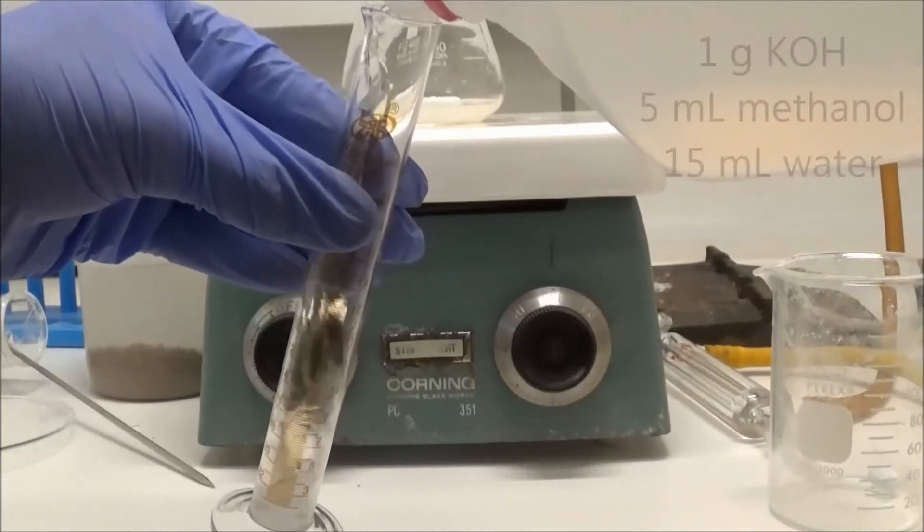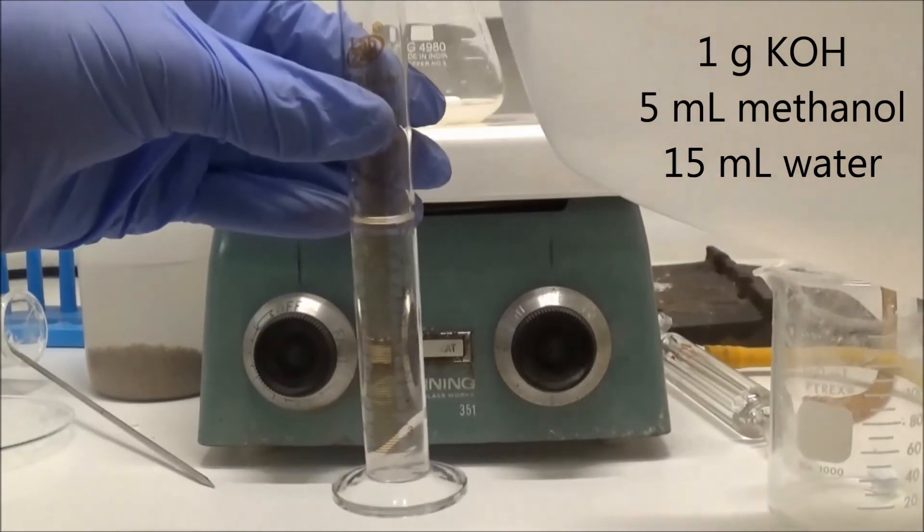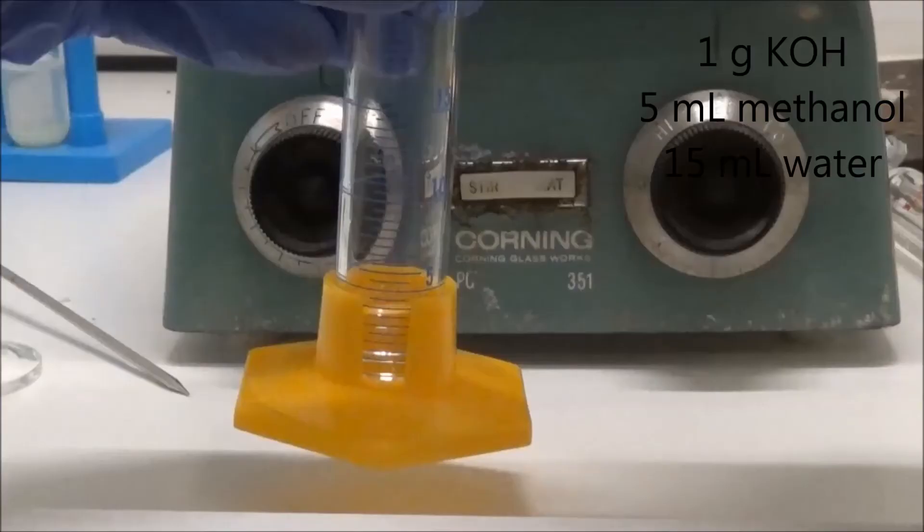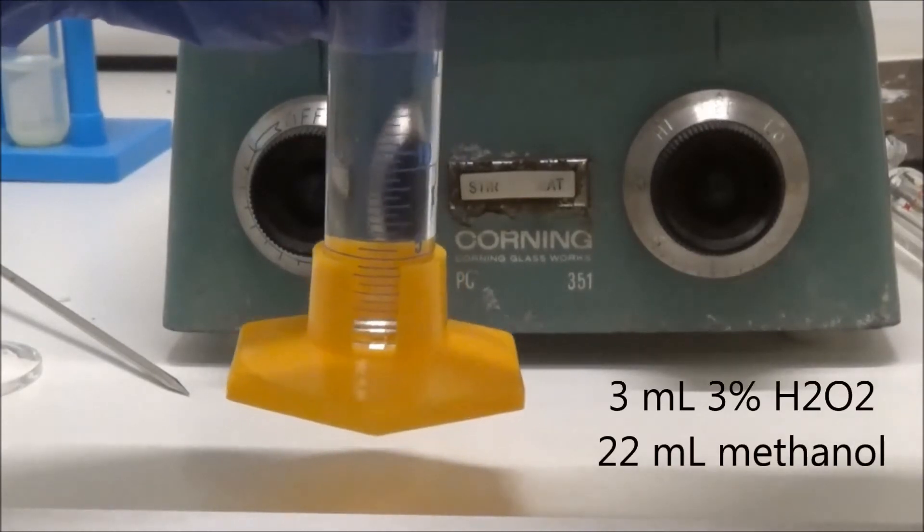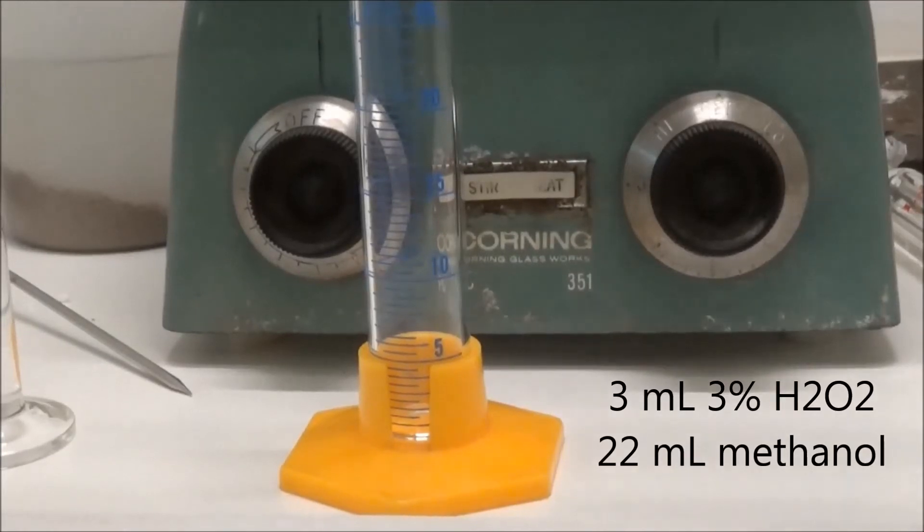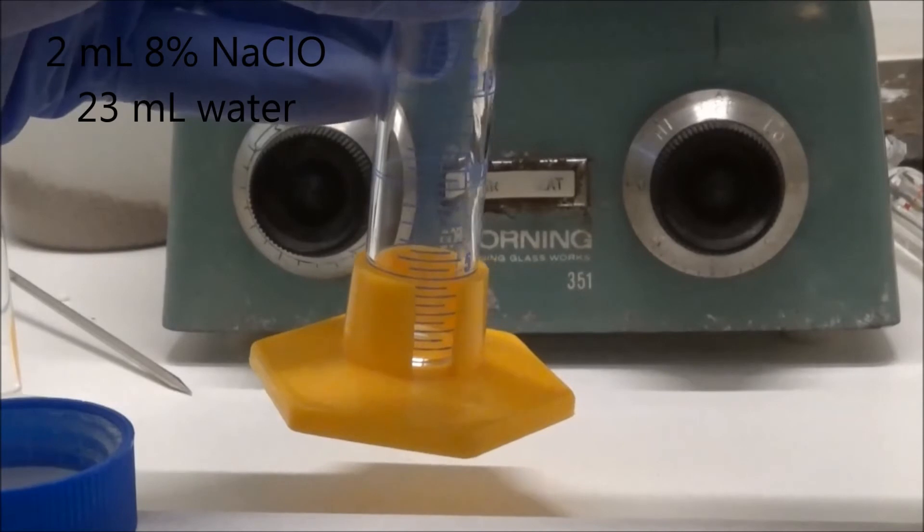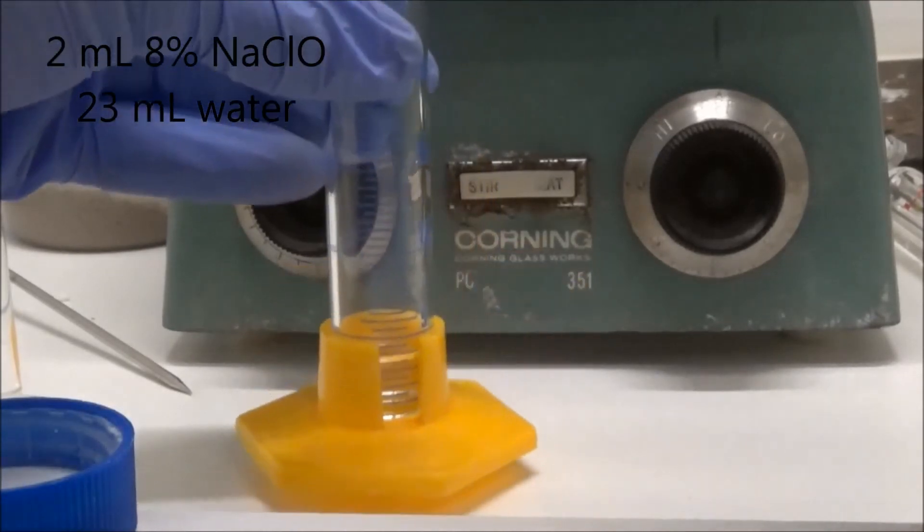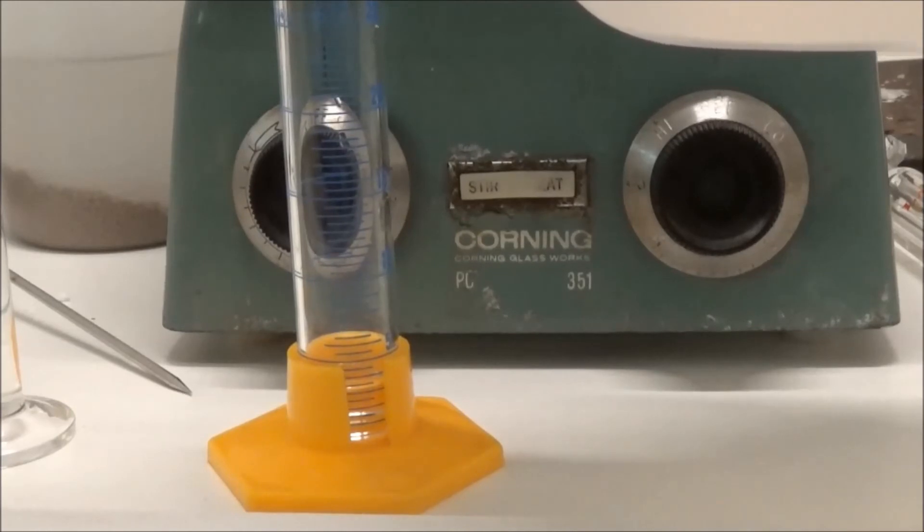I first made solution B with 1 gram potassium hydroxide, 5 milliliters methanol, and 15 milliliters of water. Solution A was 3 milliliters of 3% hydrogen peroxide and topped up to 25 milliliters with water. Solution C was 2 milliliters of 8% sodium hypochlorite solution and topped up to 25 milliliters like the last one.